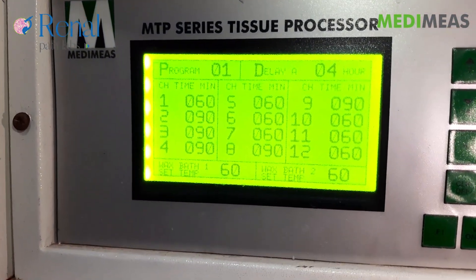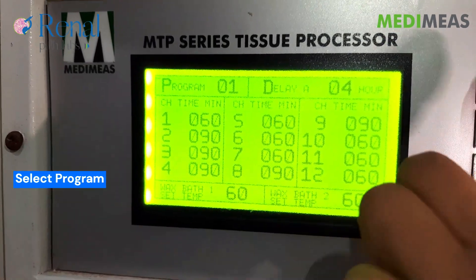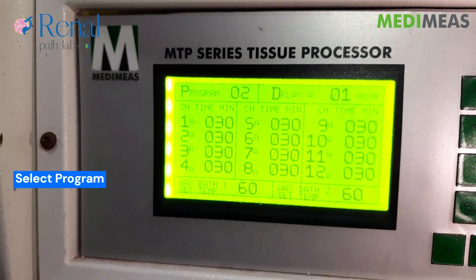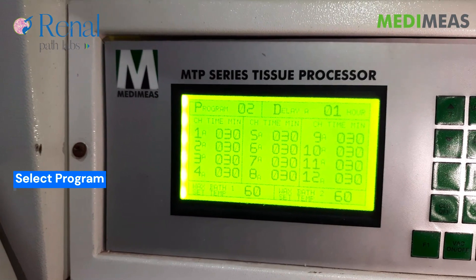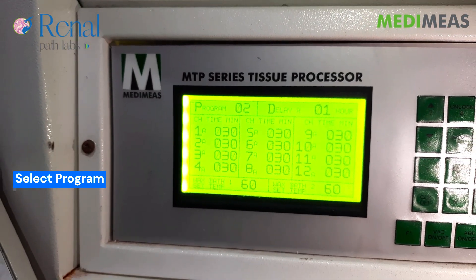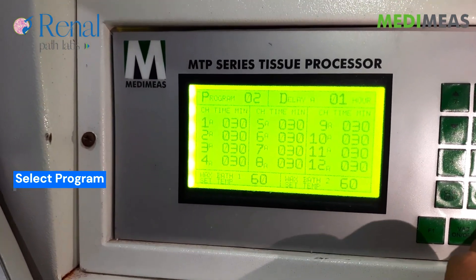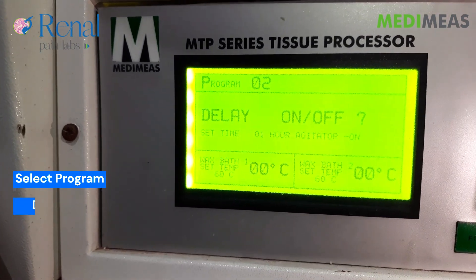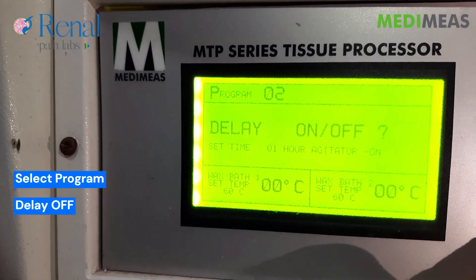It's the program and we are selecting program 2. As we have kidney biopsy tissue, we are keeping a program of 6 hours. Click on start button and we are not doing delay.